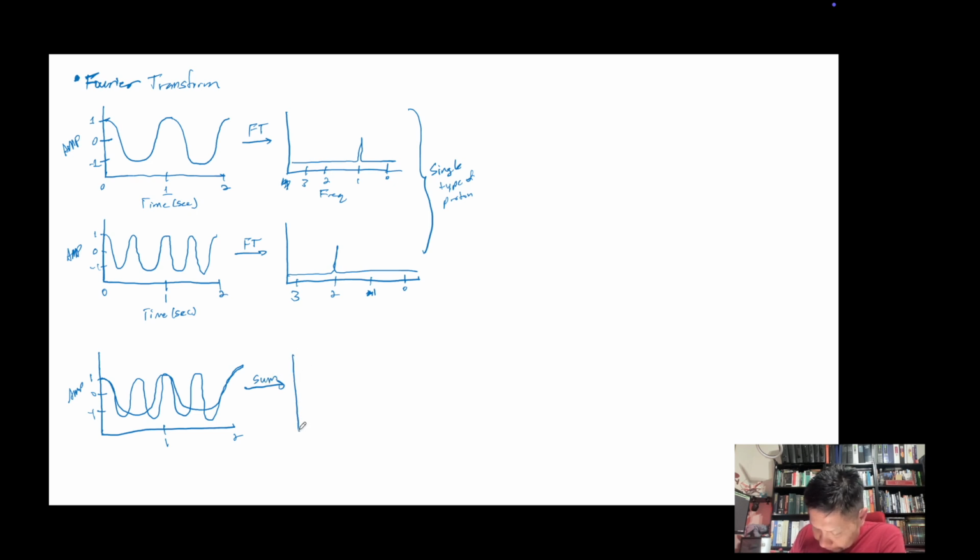And you end up getting a wave, a sum wave, right? That looks a little something like this. So now we have 0, 1, -1. And then up here we have 2. And down here we have negative 2, right? And so now we'll get the sum of the wave, of those two waves, those two cosine waves, which looks a little bit like this. Sorry, this should go all the way down here. Like that, right? That's the sum of those two waves.